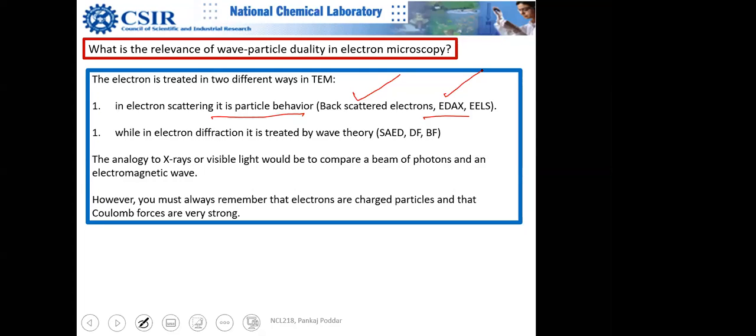But here the energy resolution is not that good, because chemists are demanding more and more, what you call it, dil mange more. तो अगर दिल ज्यादा ज्यादा कुछ मांगेगा, बोलेगा नहीं यार मुझे तो ऑक्सीडेशन स्टेट भी चाहिए, I want valence state, मैंगनीज +2 है, +3 है, मैंगनीज का पड़ोसी कौन है. So then these techniques are not very good for you.